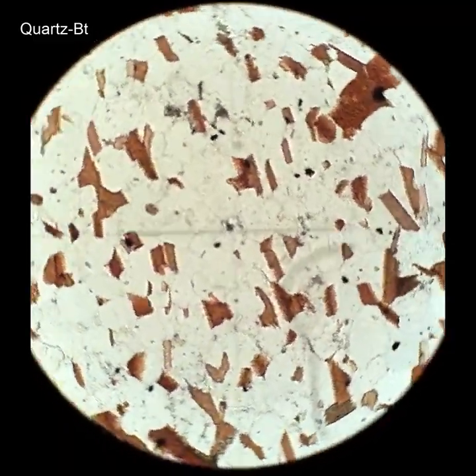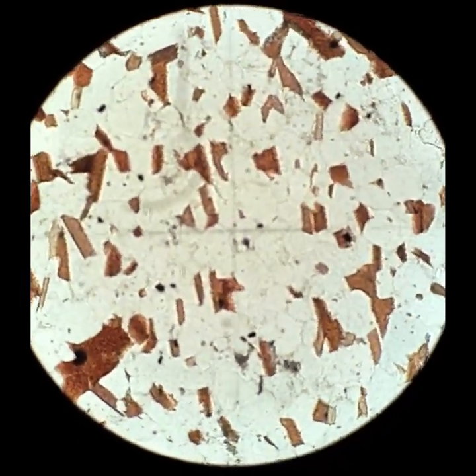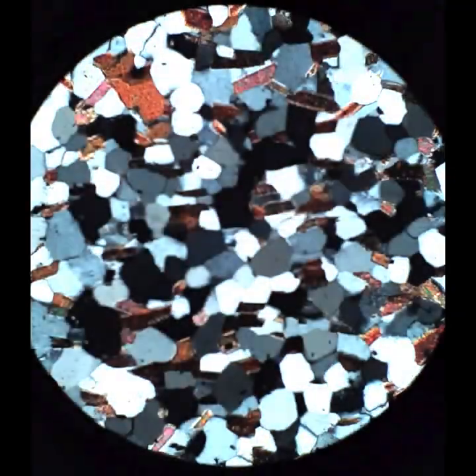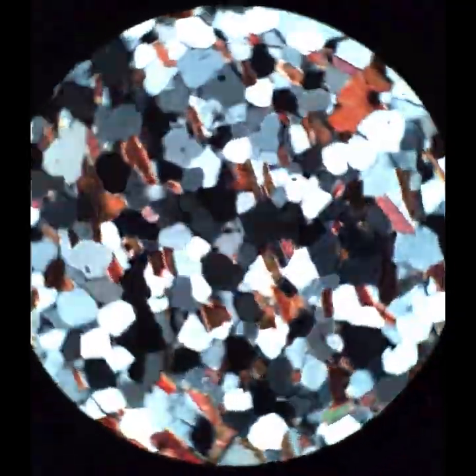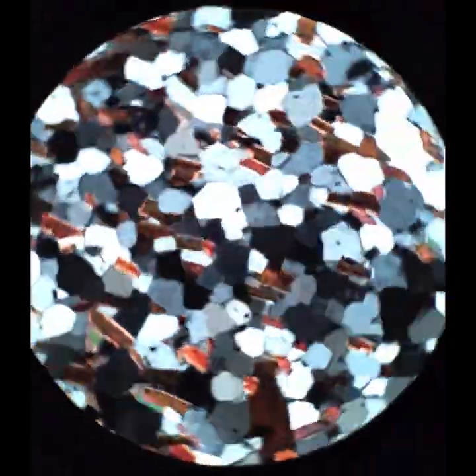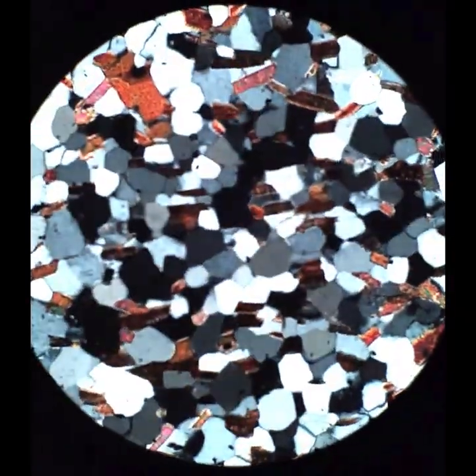Here's another quartzite. This one just has a lot of different grains, and you'll see that there are numerous grains in different orientations, but there are a couple that are also black in cross polars all the time. And again, it's simply because of an idiosyncratic orientation that the C-axis is almost perpendicular to the plane of the section. Most of them just show the normal black and white interference colors.